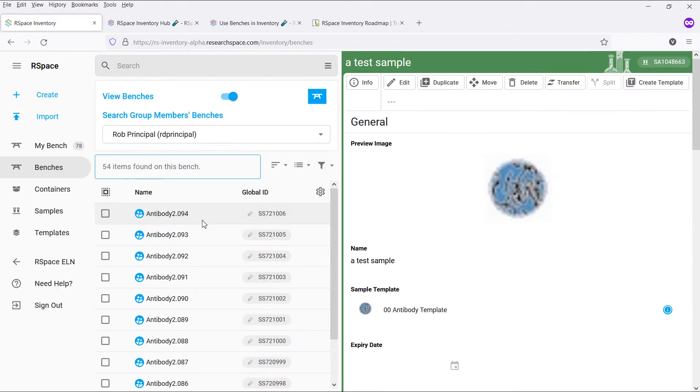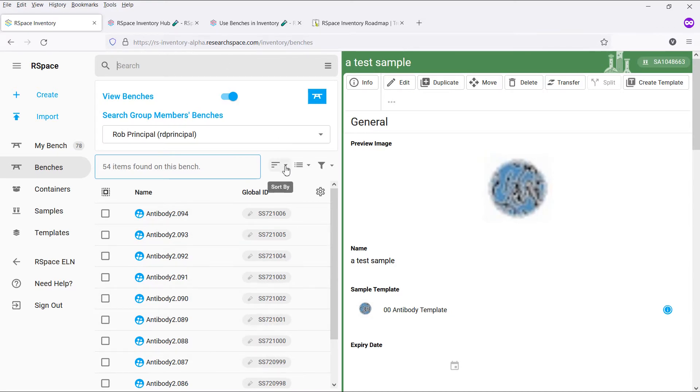Note that you can perform all the same actions as in other locations when viewing benches, such as searching for specific items, sorting the results, changing the view between tree and card view, and filtering the results by just mine.